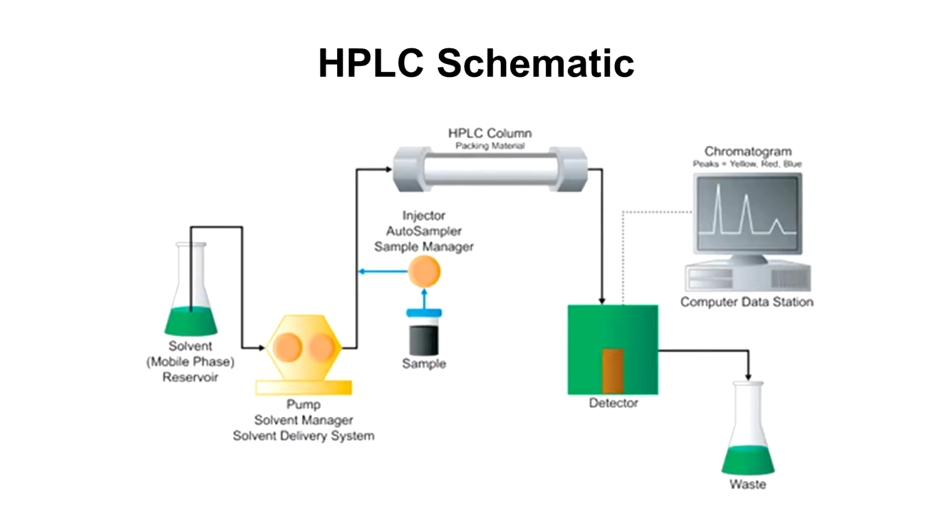Standard HPLC process involves mixing a solvent with your mixture, putting it through a pump, adding your sample, and pushing it through your HPLC column, and associating it with the detector. The detector can be a mass spectrometer, a fluorimeter, a UV spec, even an NMR.